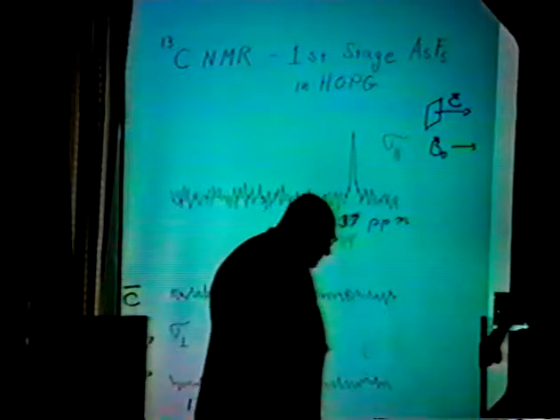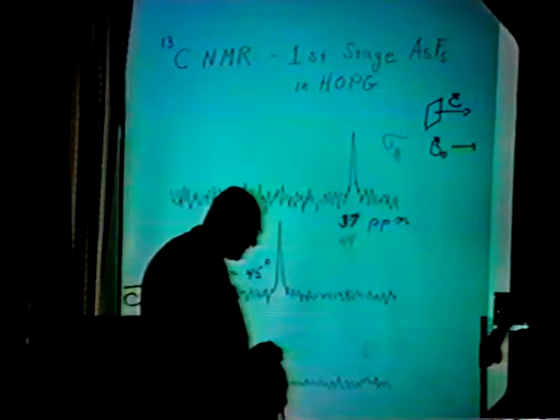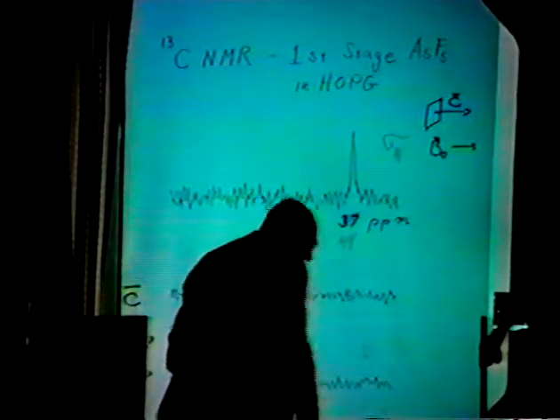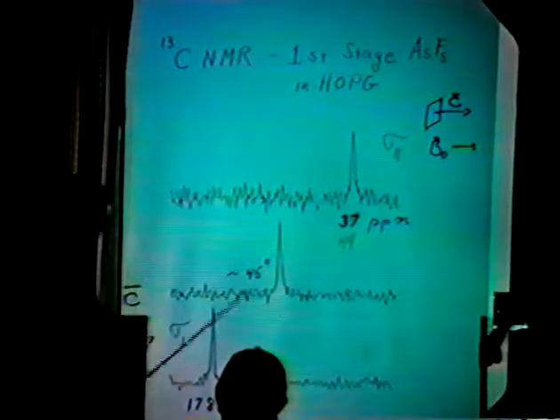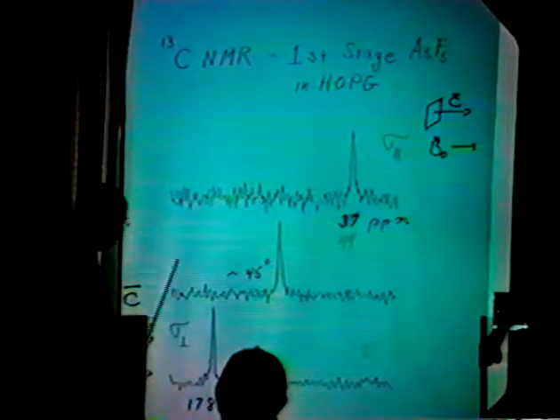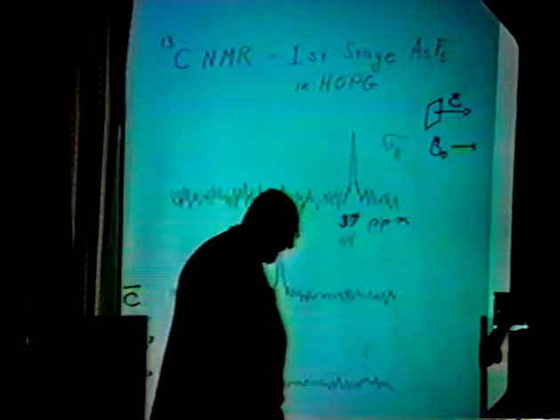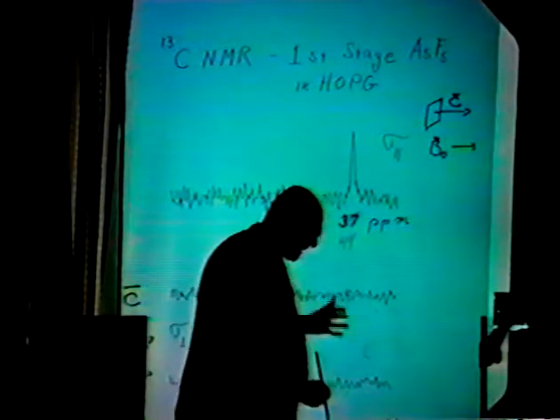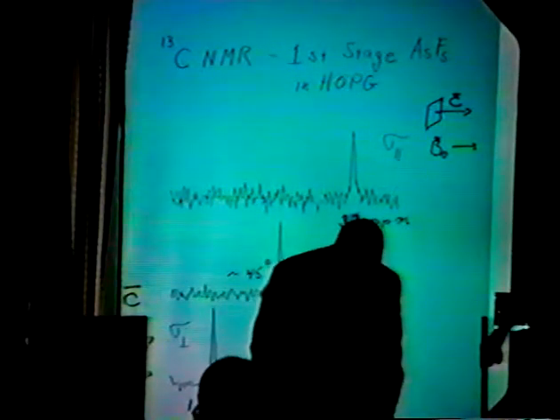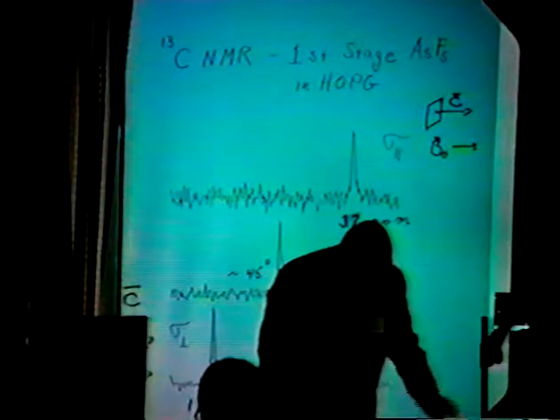Well, I believe it's because in the graphite there is poor stacking of the planes. When we put in the intercalant, we actually free the planes from the influence of the neighbors, and in this case, we go to a disordered arrangement of planes with respect to one another. And this is able to give us very sharp spectra.